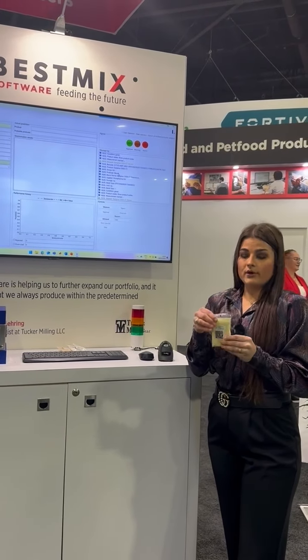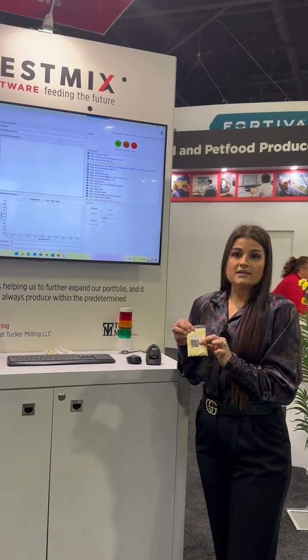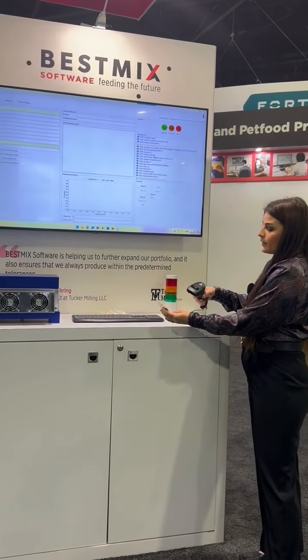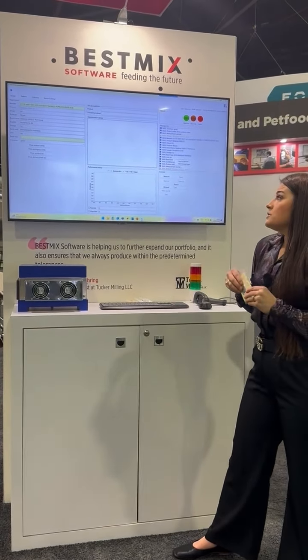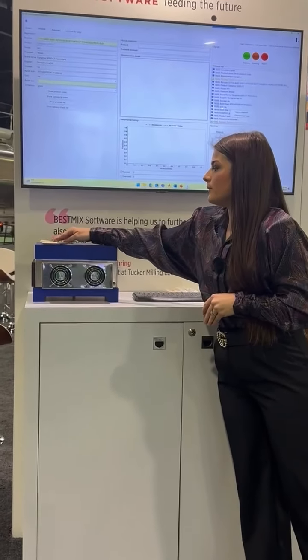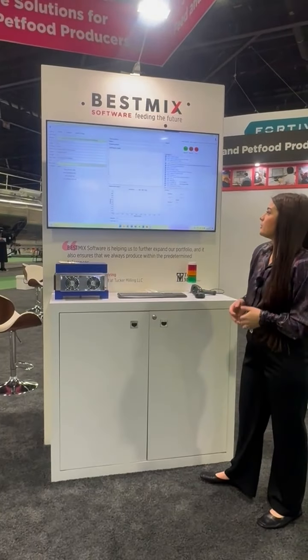The truck driver will bring in the sample in this bag, also with the delivery order form that's indicated here with this barcode. First, we'll go ahead and scan that barcode, and that's just going to tell us what this is supposed to be in this bag. From there, we'll place it on the NIR, where we will detect what is actually in that bag or that raw material shipment that was brought in.